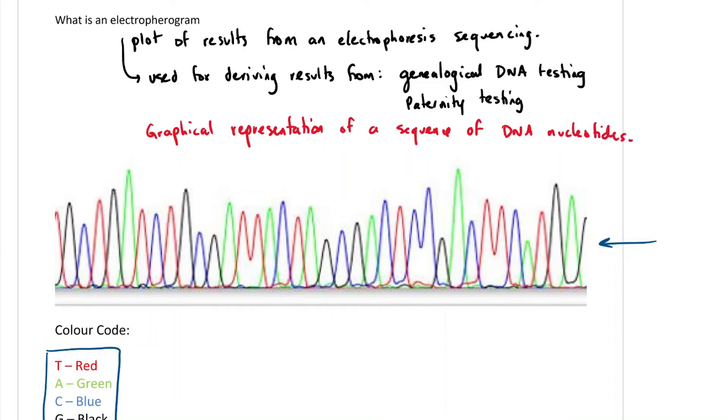And to read this, it's actually quite easy. You'll always be given some sort of color code. The color code is given down here, and as soon as you know what the color code is, you can actually start plotting this all the way through.